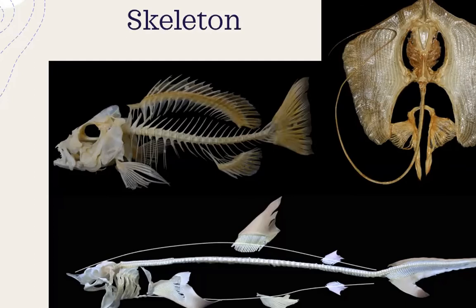Firstly, you can use a knife, a cutter, to cut it first, because sometimes it's a little bit thick. When it is thick like this, we can use a cutter to cut it, and that means we can remove it easily. After that, there is not too much flesh left, so we can remove it with the toothbrush. Also in the shark, we did the same thing. On the shark, the cartilage bone on the head is clear to remove piece by piece of the shark meat.